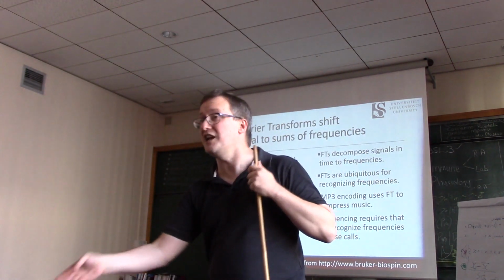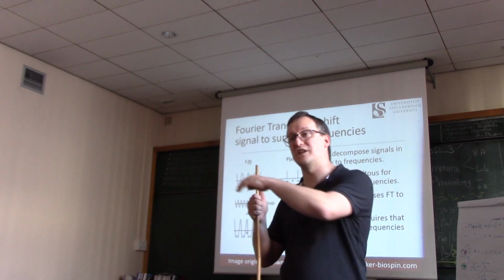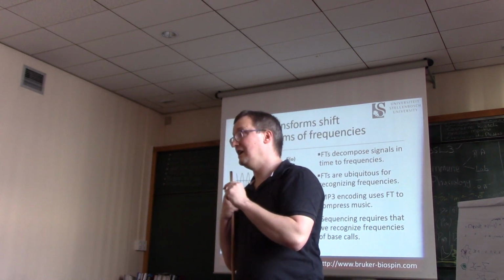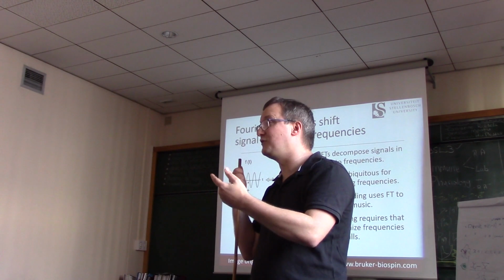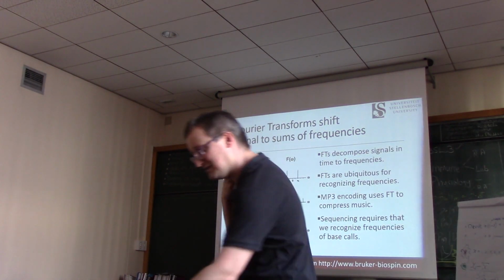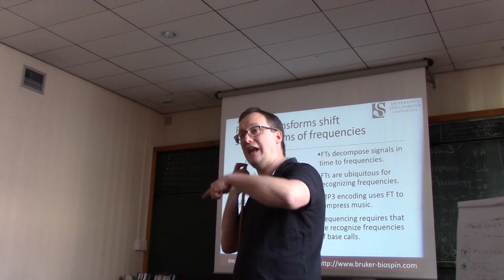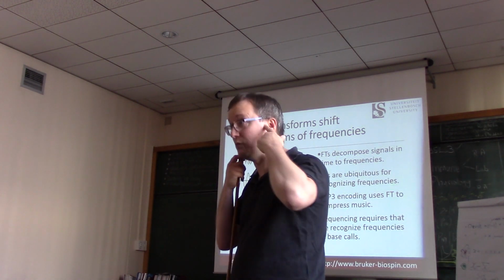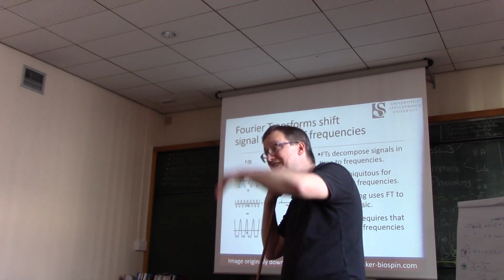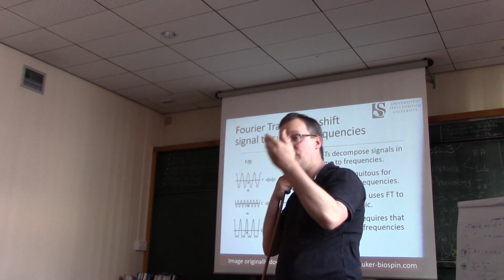Okay, so Fourier Transform is the way that we transform these time-dependent signals into frequencies. So anytime you hear Fourier Transform, you should think to yourself, there's a frequency detection taking place. But here, instead of looking at amplitude as a function of time, what we think of as sound, we're looking at signal intensity, fluorescent intensity, as a function of separation time.